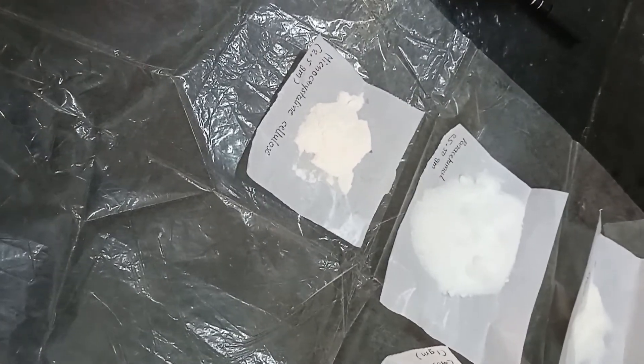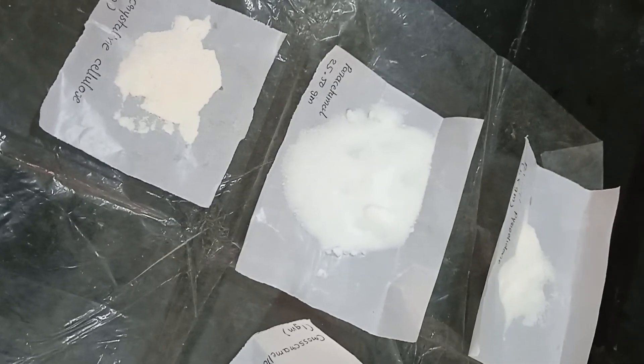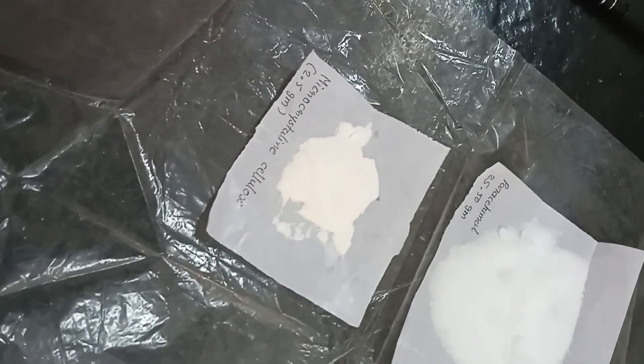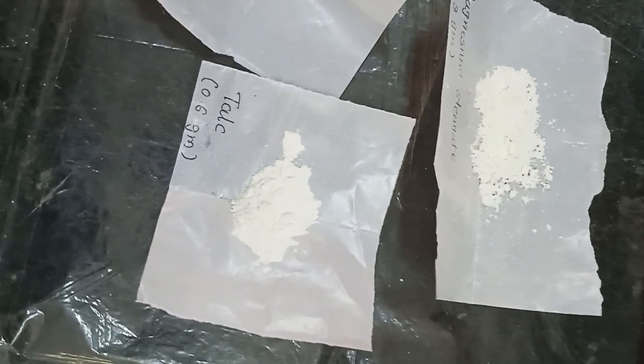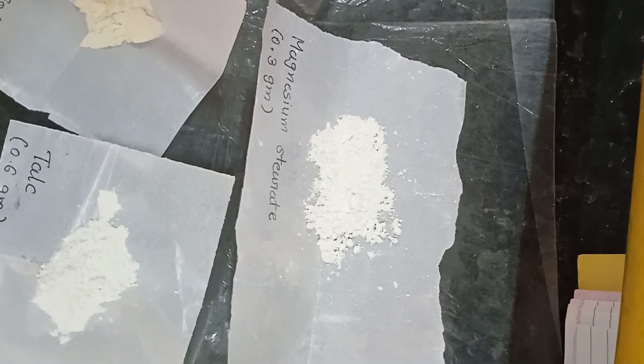To prepare paracetamol tablet, we require: paracetamol 25.50 gram, micro crystalline cellulose 2.5 gram, PVPK30 1.5 gram, cross carmellose sodium 1 gram, talc 0.6 gram, and magnesium stearate 0.3 gram.